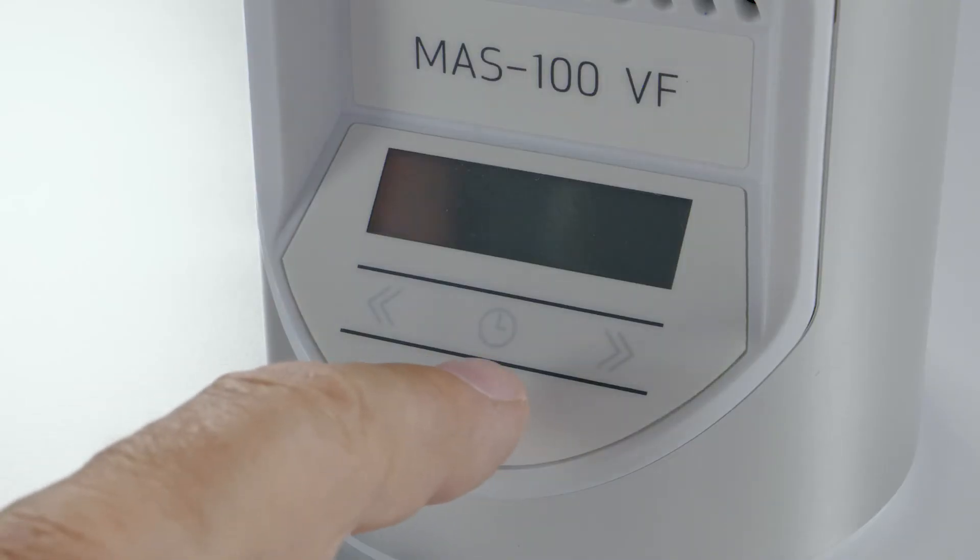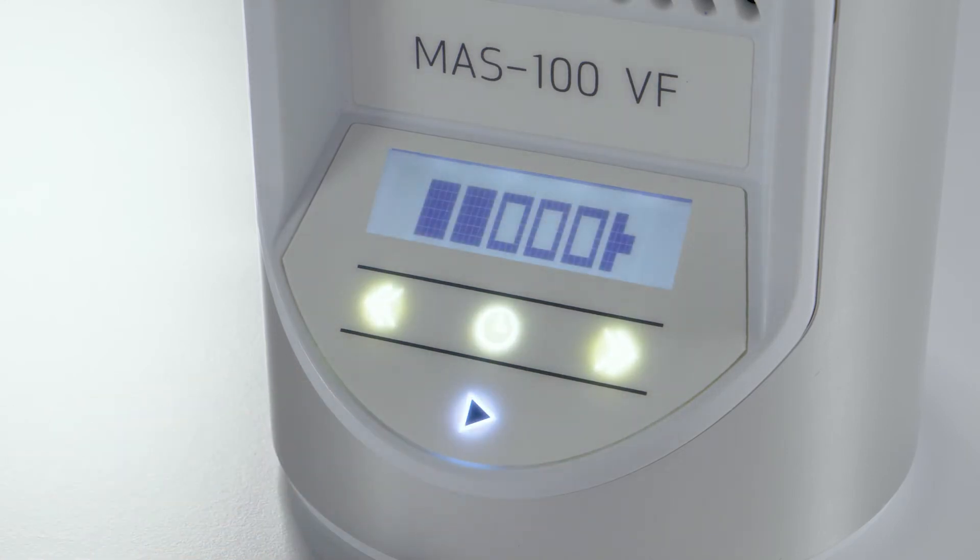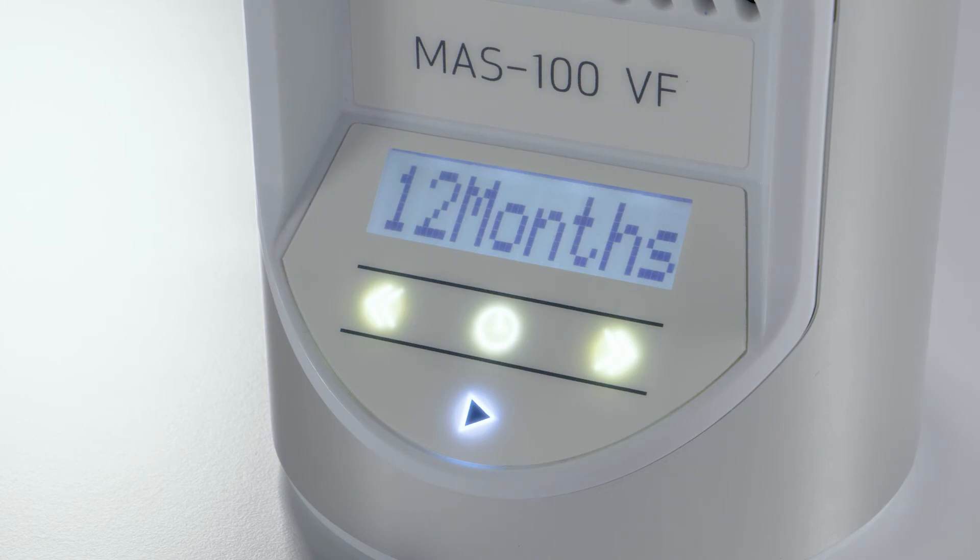At the time of calibration, the interval is set to 12 months. This is the recommended calibration interval. The interval is activated the first time the instrument is taken into operation. After activation, the calibration reminder is shown at every instrument startup.